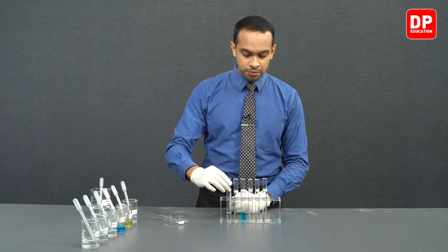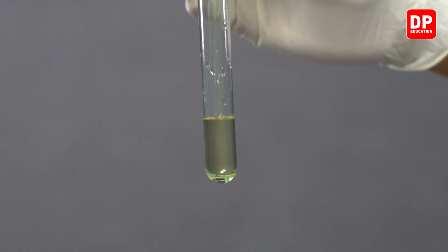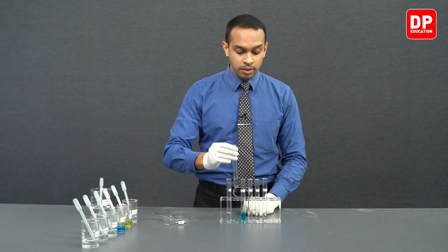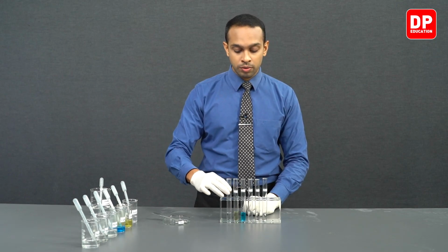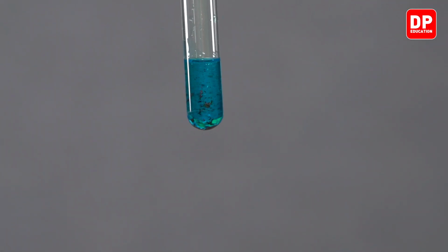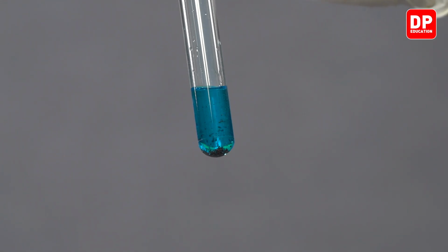We do not observe a very fast reaction happening in any of these test tubes. For example, if you take our Fe2+ or ferrous iron solution, you do not see any bubbling or any other reaction taking place really fast. However, if you allow these test tubes and their solutions to come into contact with zinc metal for a period of time, at that point you will observe a reaction happening. For example, right now in the copper test tube, you can see a reaction taking place. As we mix it, you can see a brown color precipitate is formed already.